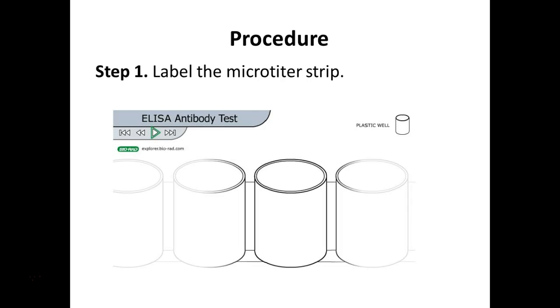And then you have another rack, right, that you can set that rack in that doesn't have a rack or strip. So you have another rack in there, Jess. You should have another white rack for holding your strips. Yeah, there you go. So flip that over and then set your strips. Yeah, there you go. It'll keep it from getting knocked over.